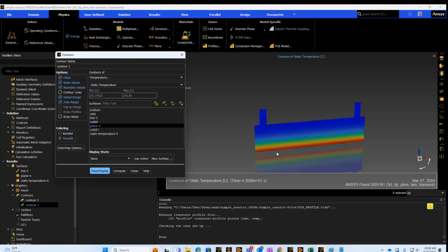So this tells us that this design will not work, and we would need to implement another way of heating. One simple way would be to add a heated top. This would become tricky because from a PCR point of view, you also need to have optical clarity to be able to take measurements of the signal.